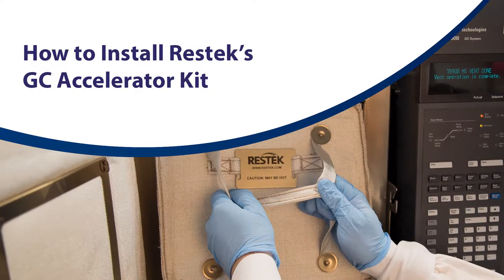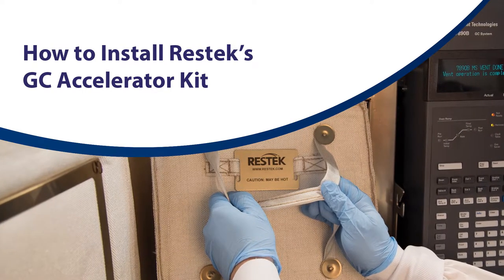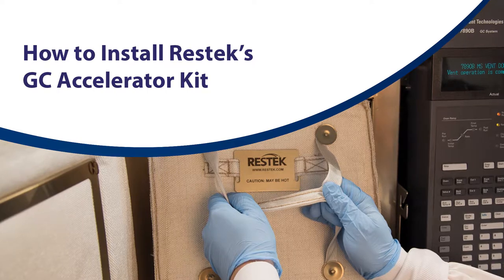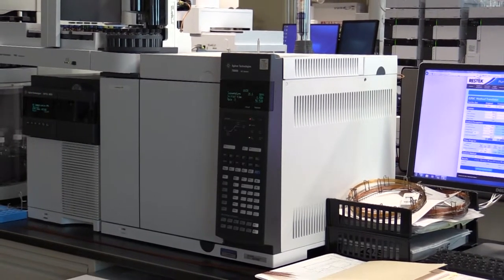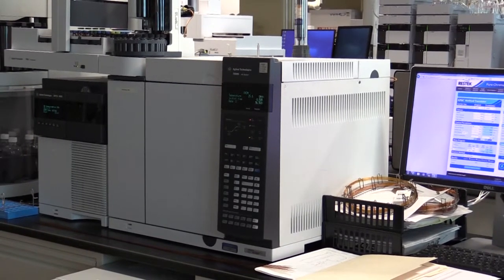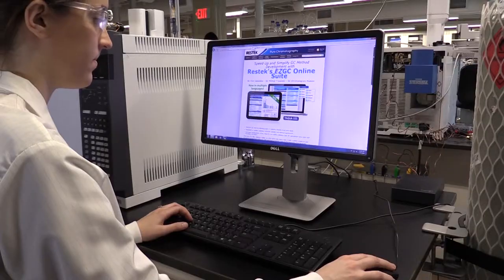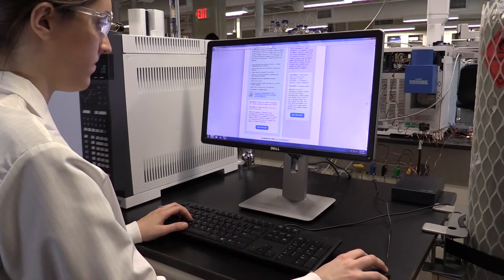The Restek GC Accelerator Kit reduces oven volume in Agilent 6890 and 7890 GCs equipped with mass spectrometers. This allows for faster oven ramp rates and quicker cool down times, which means faster chromatographic methods can be developed.